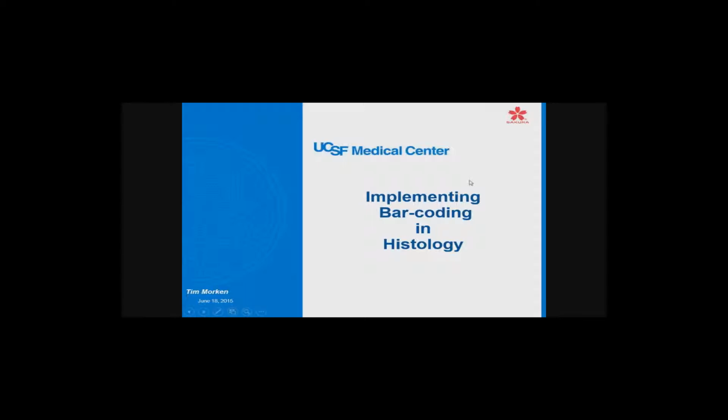People have talked about how barcoding would be so great, and there have been a lot of presentations at NSH and other meetings about why barcoding is such a great thing. But what I wanted to do is go through the process of implementing barcoding in our laboratory, and give the process of actually implementing it rather than just talking about how great it is. So that's what this presentation is about.